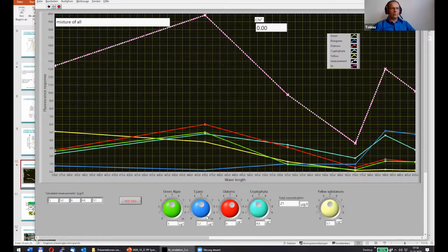You have 5 microgram green algae, 5.2 cyano, 6 diatoms, and 4.8 cryptophyta, and the total content of 21 microgram chlorophyll A, and you have also 5.1 microgram yellow substances. That is the principle.